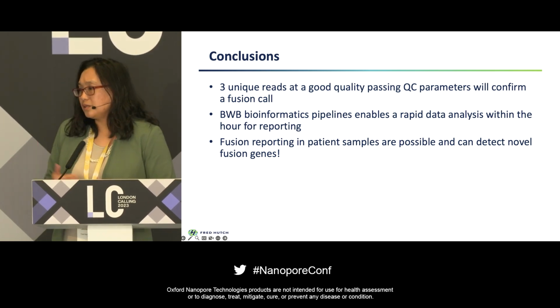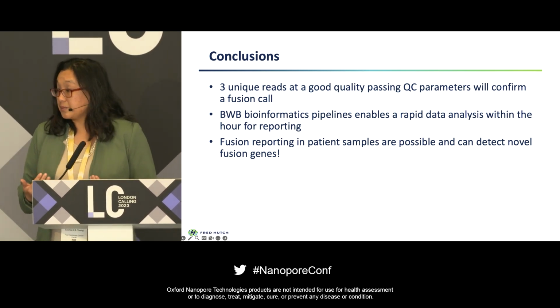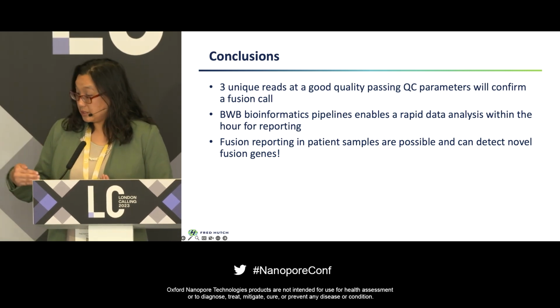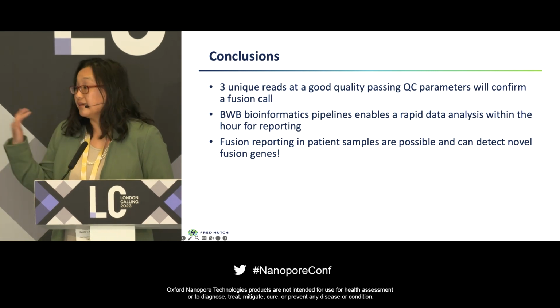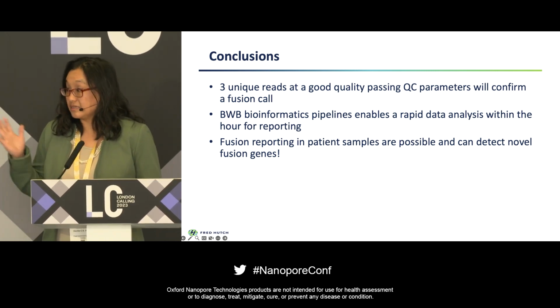And the BWB platform is really nice because it is a cloud-based platform that we can actually get things in real time. And fusion reporting, as you can see, is extremely important now that more than half of our entities are defined by that.